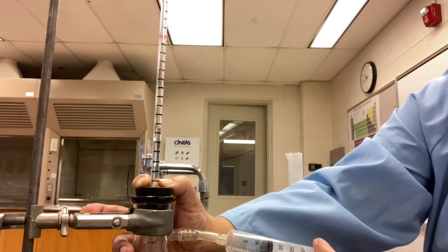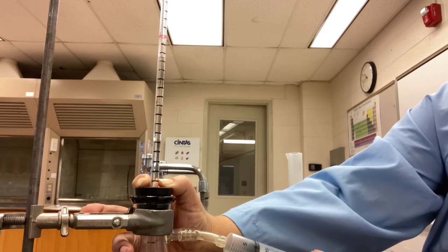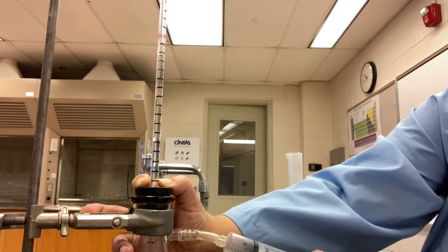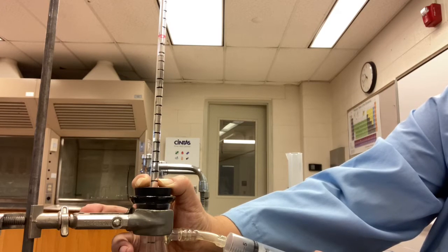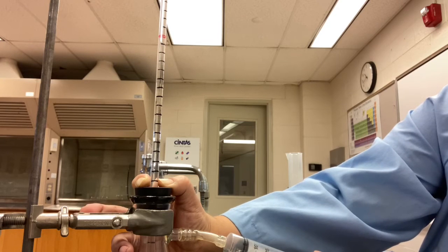So putting it into 10, our level is now just shy of 35. I have to go back 2. So 35, 34, 33, 32. So 32.8 is at the syringe level 10. At syringe level 5, I'm going to be at 35, 6, 7, 8, 9, 39.4.